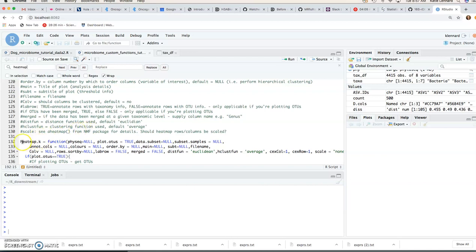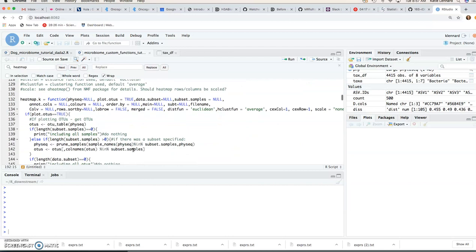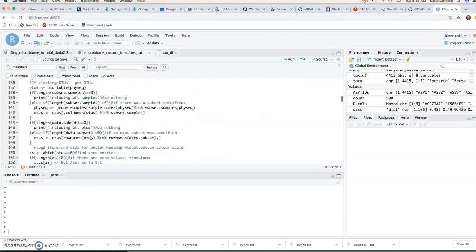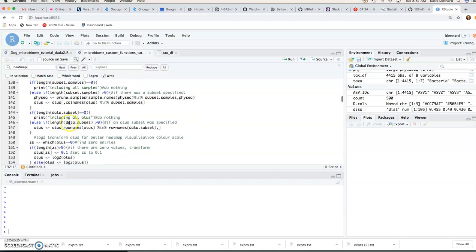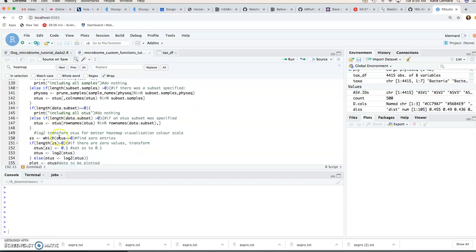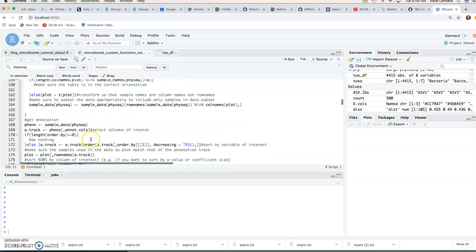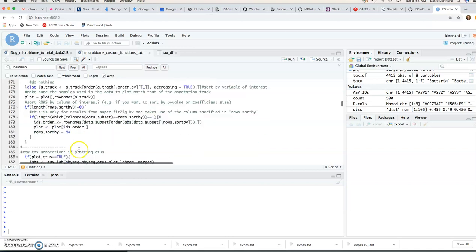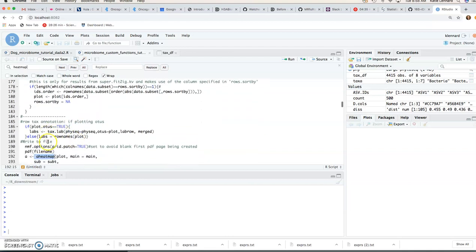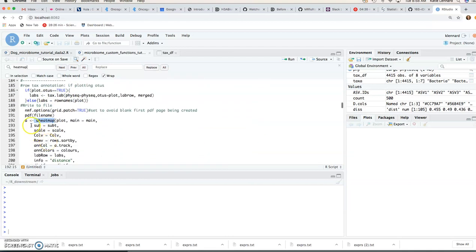So this is the actual heatmap.k function with the parameter specifications. You'll see a lot of them have default values and you don't have to know the detail here. You can have a look if you're interested but basically we're going to just prepare our OTU table, log transform the data.